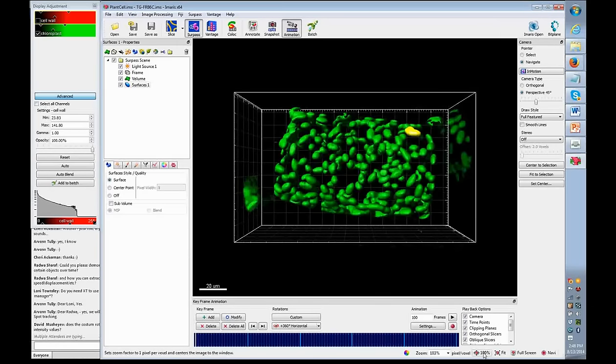If you are wanting to get the most exact segmentation possible, it does allow you at an intermediate step to add and remove spots. So if you put the pointer in select mode, the cursor gets a box around it, and you can roll the mouse wheel to adjust your estimated object size. Now, it's not going to do ellipsoids, unfortunately, so it's not the best fit for manual segmentation, but it will try to center this in 3D space where you click based on the box size that you used for the object estimate. So it didn't place it at the top or the bottom of the stack. It's pretty well centered on the center of intensity for that object.